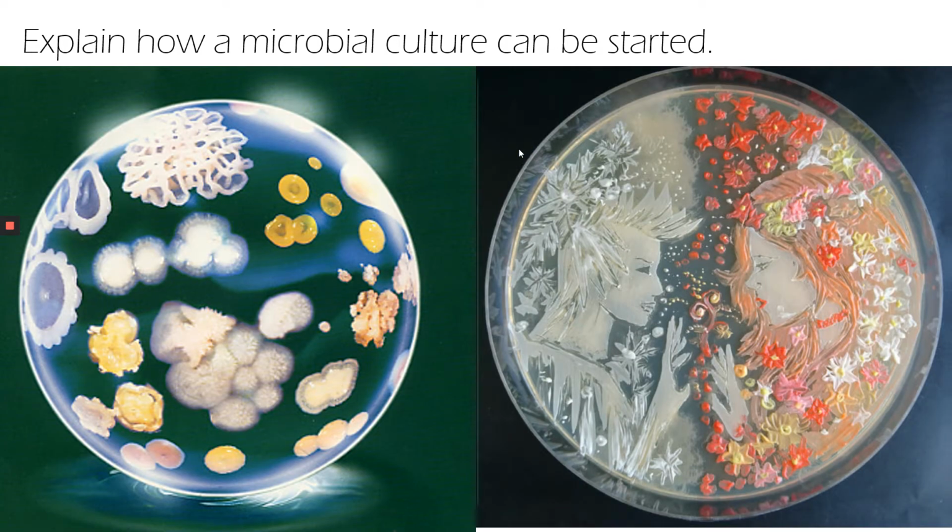Many culture media exist. When we're growing a microbial culture, we can start by using an inoculum of microbial cells on agar. So we might already have this situation here, several cells growing out in different places. We might say we want to take this cell and use it to start a new culture. So we would take our flamed inoculum loop, we'd lift this off and move it somewhere else. So we can use microbial cells on agar, or we can use a broth with suitable nutrients as well. So there's lots of different ways we can do this.